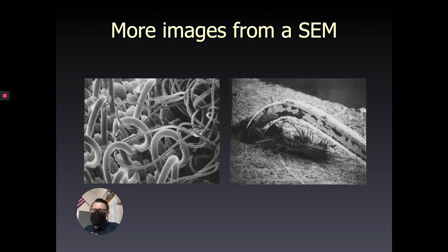So here we can see the fibers of the paper, and then the staple is the big metal thing sticking through it, but obviously it's a little tiny wire. Here it's magnified. The dark spots on the staple are the glue that holds the staples together inside the stapler. So you have tiny little staples glued together, and when you smash the stapler, it bends that wire and pokes through the paper on the other side.